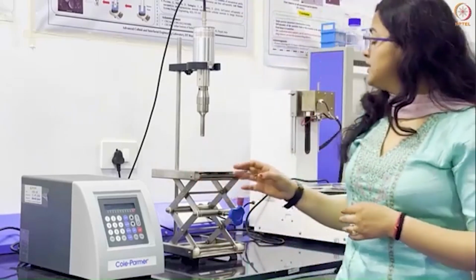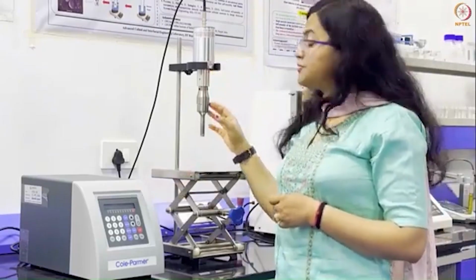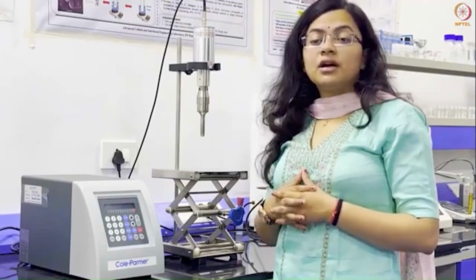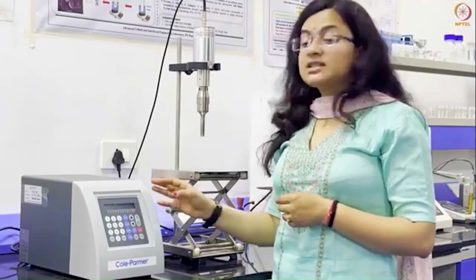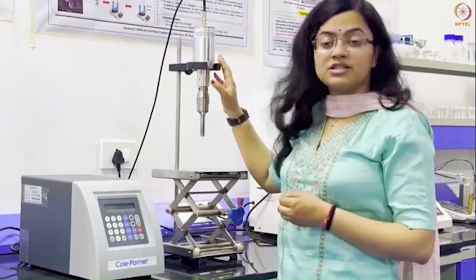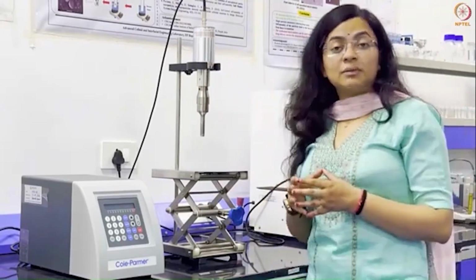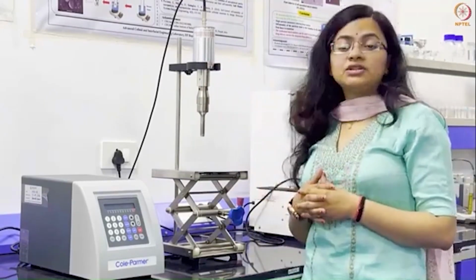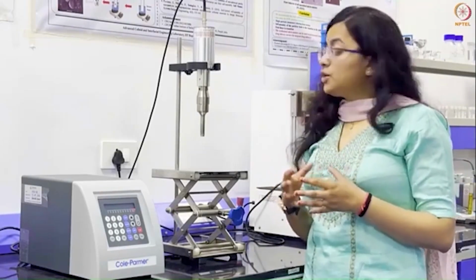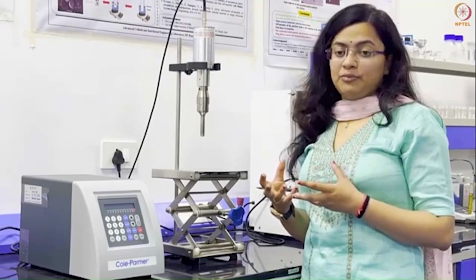It has three components. First one is the generator, the second one is the transducer, and the third is the probe. So initially, what the generator does is, the generator converts electrical signal into electronic signal, and it also controls the transducer. Then the transducer converts electronic signals into high-frequency mechanical vibration. Then the probe amplifies those ultrasonic vibrations into longitudinal vibration, creating a cavity in the sample.